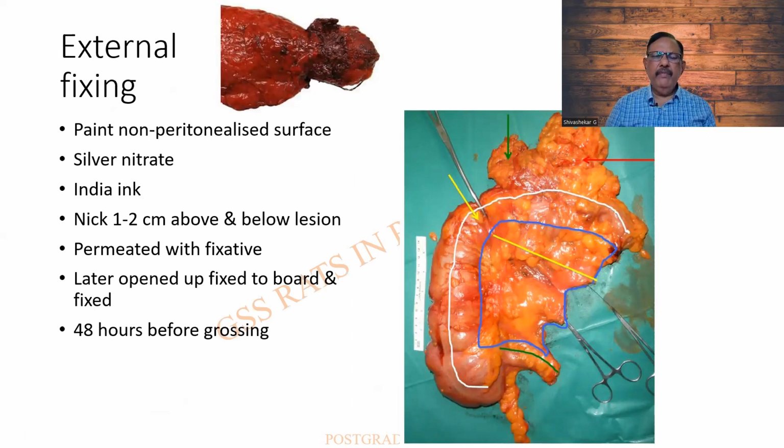And externally, even before opening, what I am supposed to see is to palpate. Generally, a specimen is clipped and it is filled with 10% formalin, kept for fixation in again 10 times the fixatives, so that both the mucosa as well as the external surface are fixed. After which there can be an open. Before which, however, I will have to palpate. Look whether there is a bulk outside, whether there is any perforation, an exudate, so on and so forth, any diverticulum, or a traumatic injury.